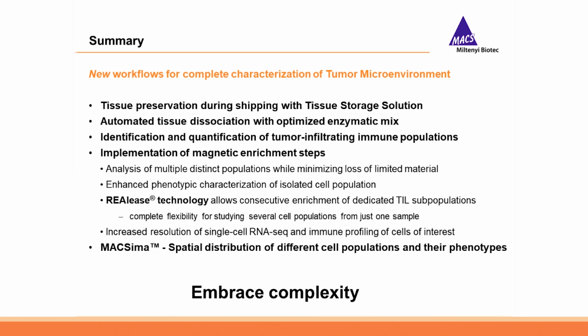In summary, I showed you here today new workflows that allow the complete characterization of the tumor microenvironment. These start with tissue preservation during shipping with tissue storage solution, automated tissue dissociation with an optimized enzymatic mix, and identification and quantification of tumor-infiltrating immune populations. By implementing magnetic enrichment steps, we are able to analyze multiple distinct populations while minimizing the loss of limited material and enhance the phenotypic characterization of the isolated cell populations.